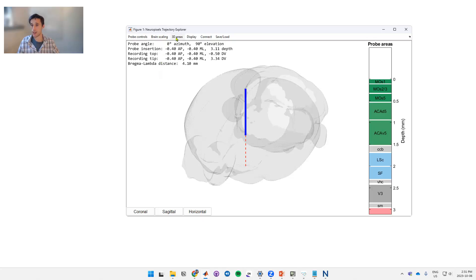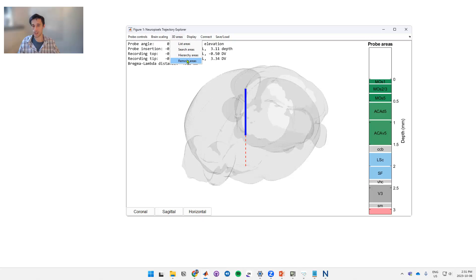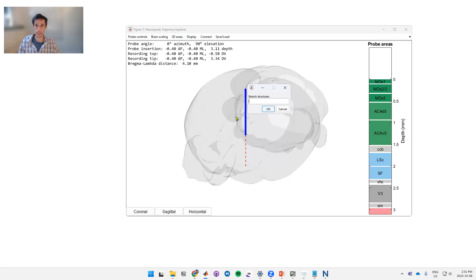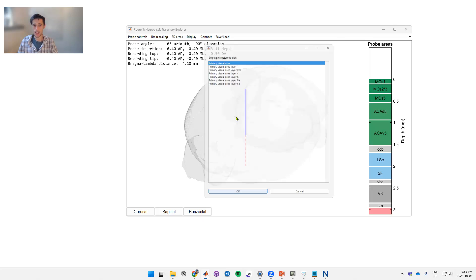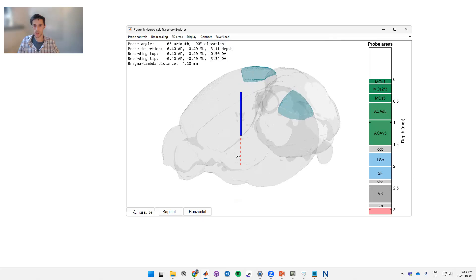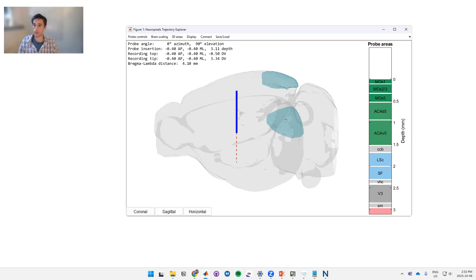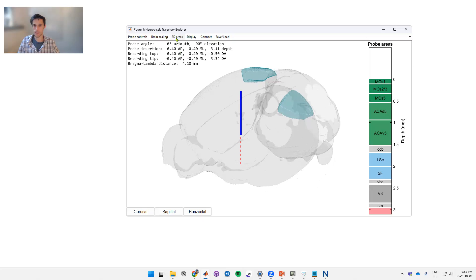3D areas. What this does is it lets you see 3D areas across the brain. So there's many different ways you can search for these. In this case let's try the search areas. So we're going to try looking at a trajectory between the primary visual cortex and the lateral geniculate nucleus. So here we'll look for the primary visual. You don't need to type in the entire thing. We have it broken down by layers or the whole area itself, so we'll click that and what this does is it draws the primary visual cortex.